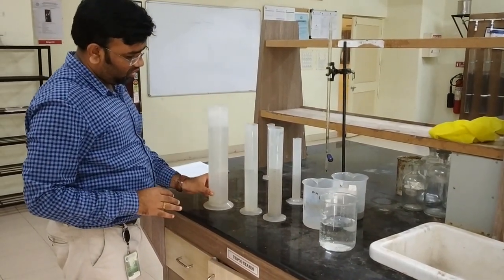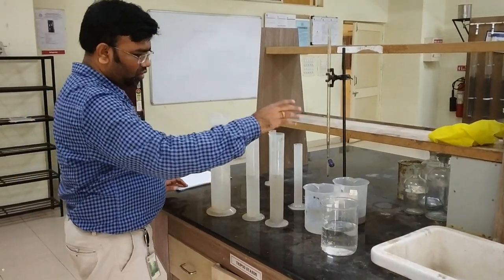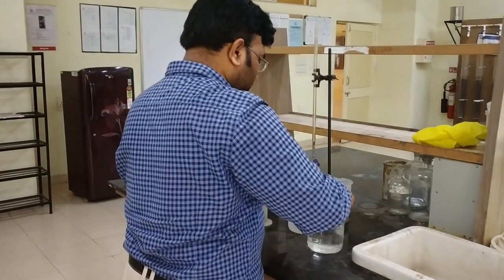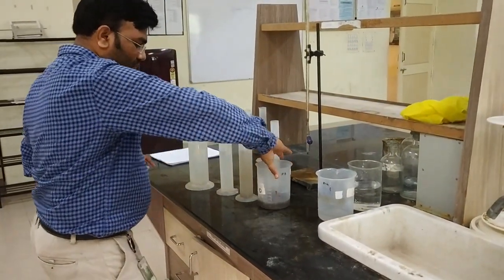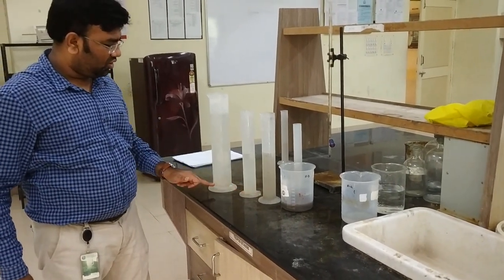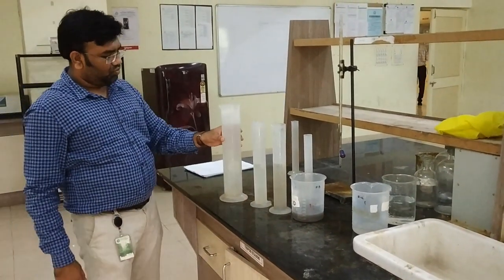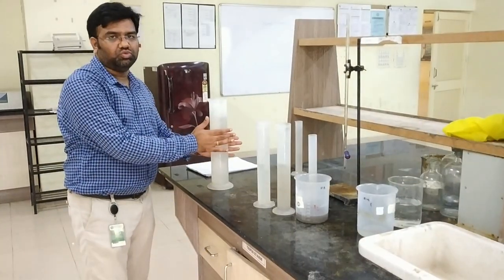You can also see the color change that has happened because of this dilution. So here it was more concentrated. So here, previously, before dilution, we have this as the sample. So here you can see how the color change has happened as we have increased the dilution. So now this is the sample of dilution factor 2000.